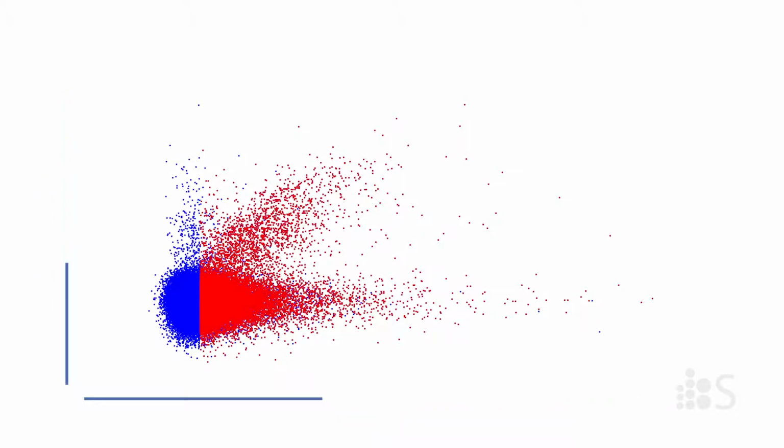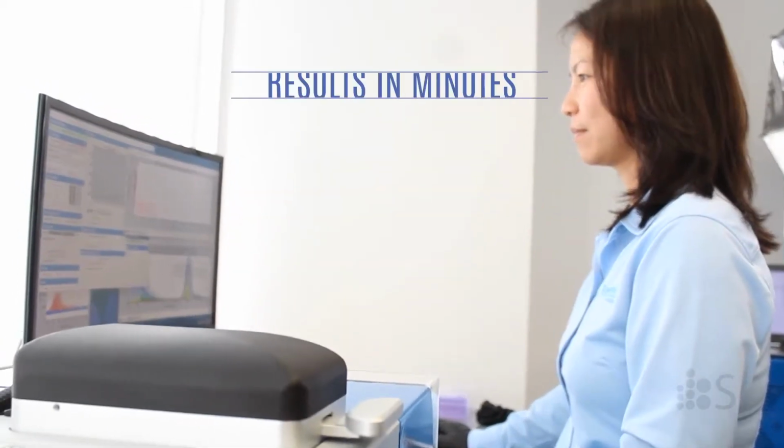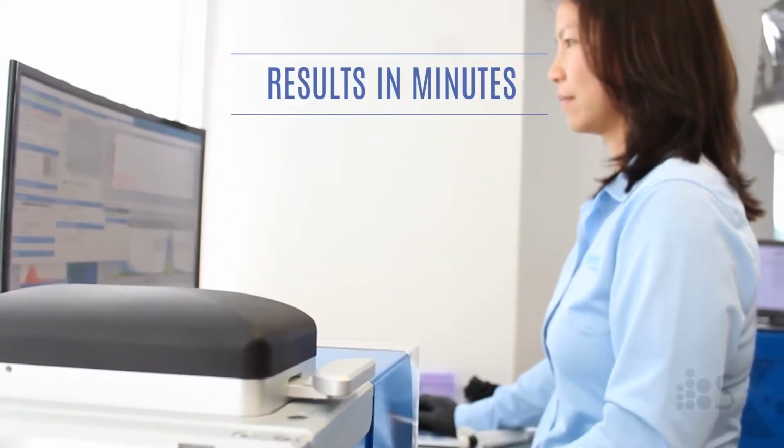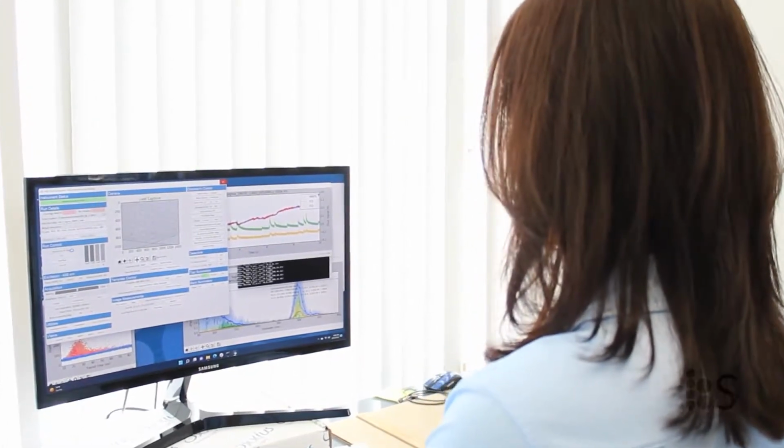You can see in this plot that the majority of particles in the sample are non-fluorescent. The fluorescence amplitude of these events is below the limit of detection, and we can see them being detected in real time. After counting sufficient particles to ensure statistical confidence in the concentration measurements, in this case a few thousand particles, we can end our run.